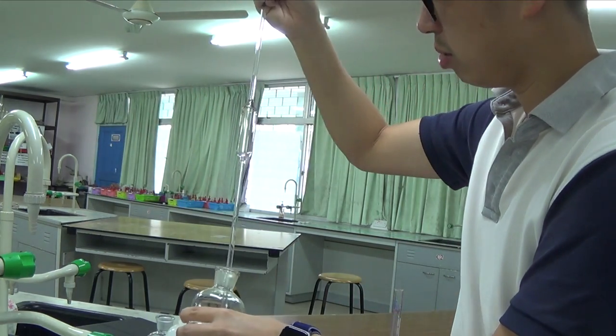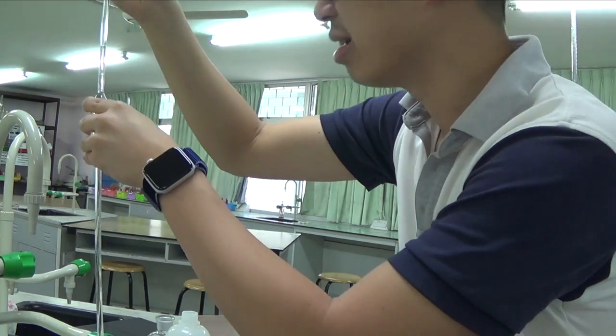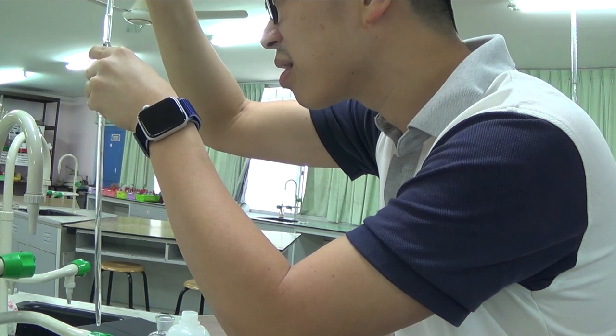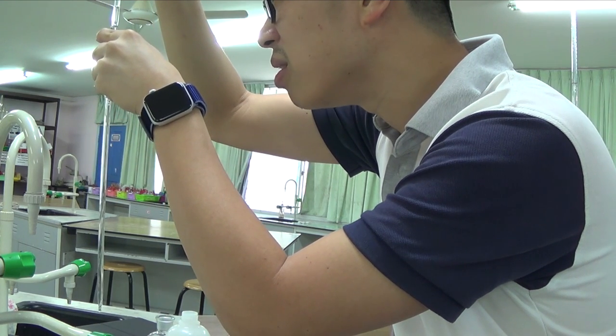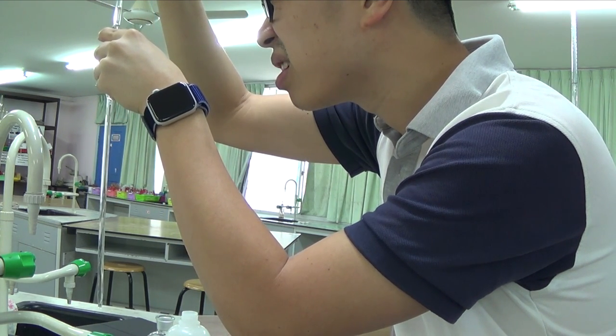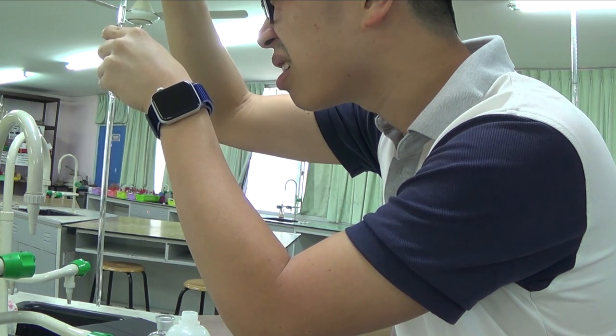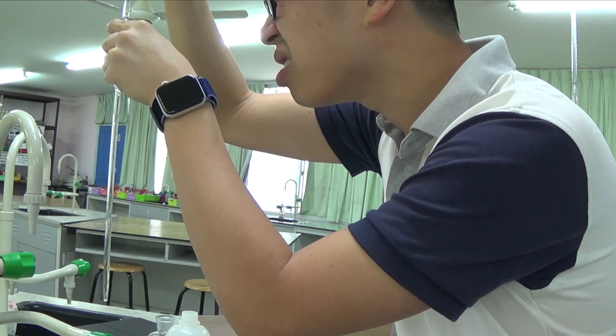So I keep on overshooting the thing. So I need to make sure that it's 25.0. Just a little bit more. Just a little bit more. 25.0. Okay.